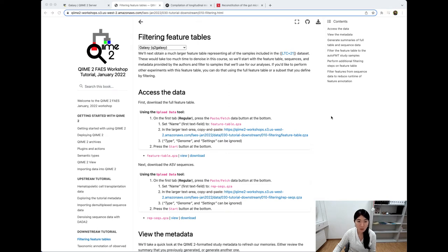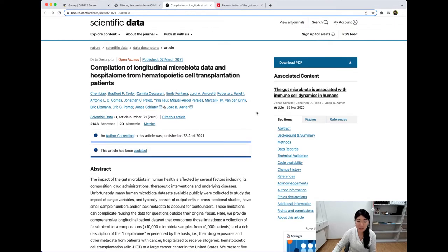Hi! Welcome to the Filtering Feature Tables tutorial. I'm Lina Kim, and I'll be your tour guide today. Filtering is really helpful for large datasets like from this fantastic study, which has over 10,000 samples and 500 million total features. That's a little too much for a workshop, so we'll filter for samples and features that we're interested in.